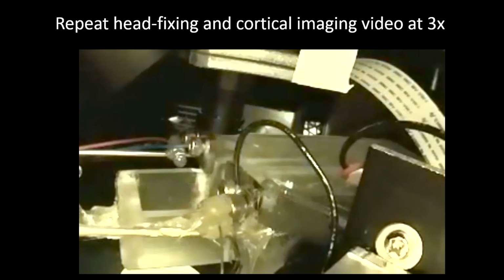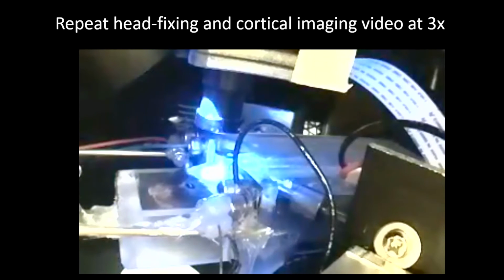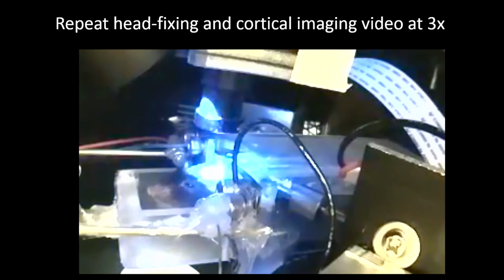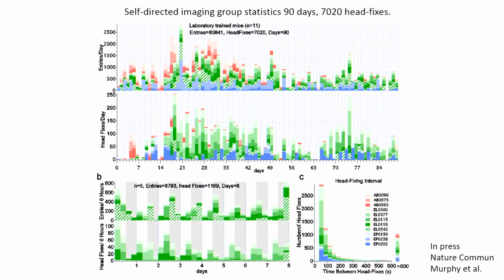We've done some experiments where we have a screen out here and we can display horizontal or vertical bars. This mouse is being head fixed, and then it leaves and then comes back for a second session, which is quite common. So the mice, we of course track their weights and their health, and doing this, you can generate a lot of data, over 7,000 head-fixed imaging sessions in 90 days' time. This is from a total of 11 mice.